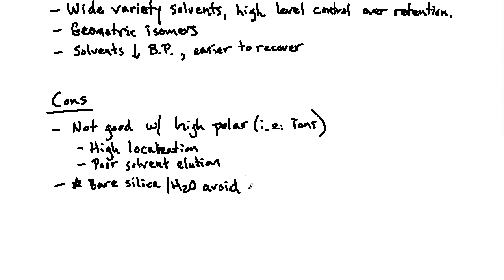One of the reasons for that is that when the water randomly combines throughout the column, this can start to produce unpredictable separation and unpredictable results. And when we talk about unpredictable results, in other words results that are not repeatable, that is a problem in science, right? We should be able to use the same solvent system over and over again with the same column, and provided the column's in good health and has not been worn down too much, you should be able to reproduce your results as far as retention times. It shouldn't be spotty or changing back and forth on a day-to-day basis.